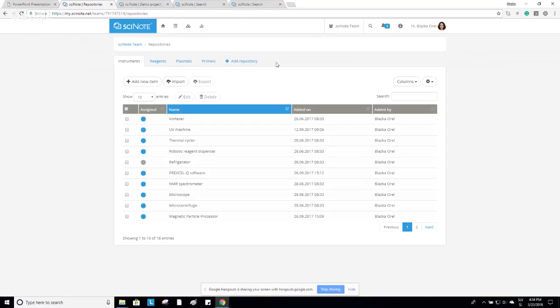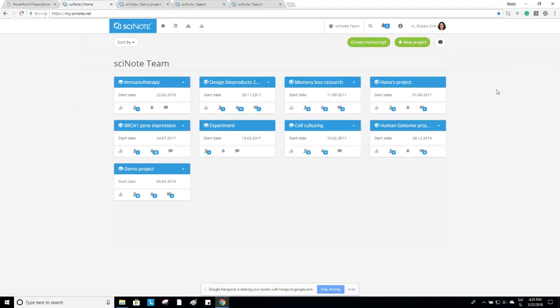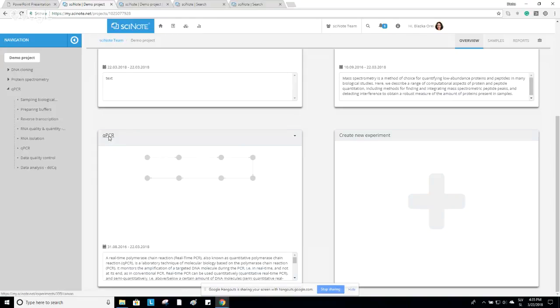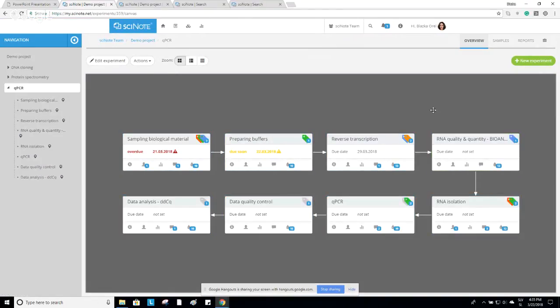Okay, so we have another question from Cesar. The question is, the system does not accept unconventional files from other applications, such as the output files of sequence analysis software. Is there a way around that? Yeah, this is a very good question, Cesar. The workaround would be that you could simply take a screenshot of this data that were output of, let's say, a machine. So you would create a screenshot and then upload it as a picture. This would be a workaround.